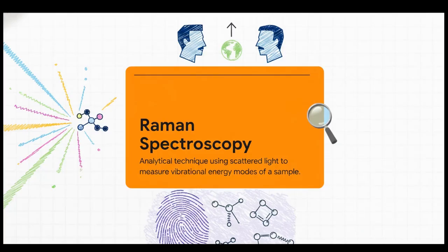So when a beam of light hits an object, a few things can happen. It can transmit right through, it can be absorbed as heat, or it can scatter. And that scattering, that is exactly what we care about today. This brings us to Raman spectroscopy.